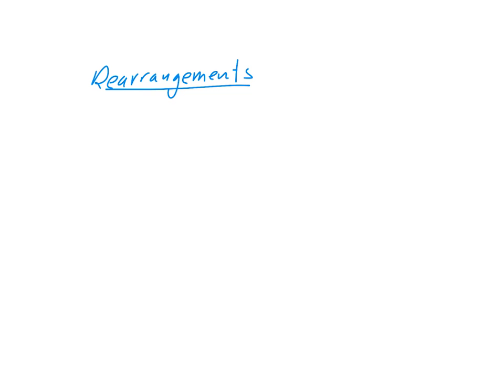I think what I showed you was the generic mechanism for what will lead to this McLafferty rearrangement. So let's look at a slightly more specific example.